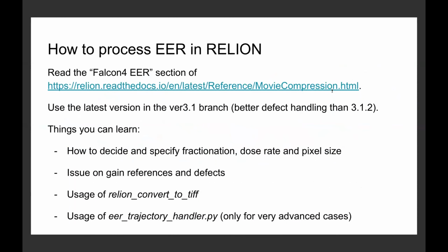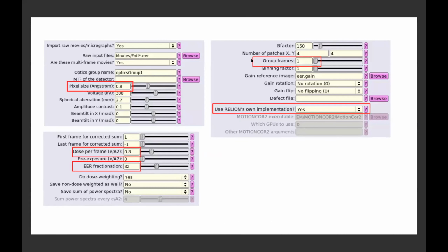I don't have time to explain how to process EER in RELION, but it is now implemented in RELION 3.1, the latest version. And please read this section in our help documentation. It explains all necessary fields, what you have to fill in.